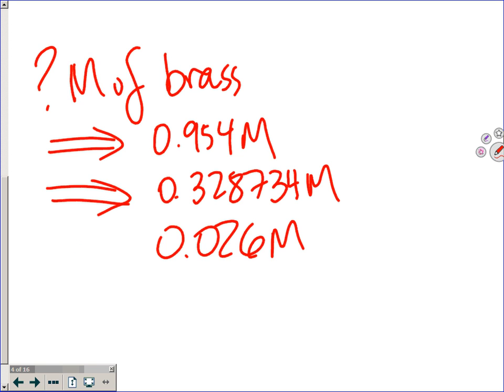This sounds more like it. It's small, but go with it. It just depends on your readings from your calibration. Go with it.